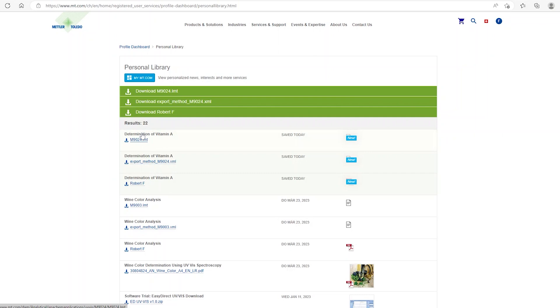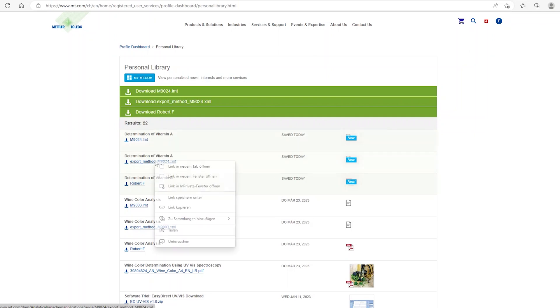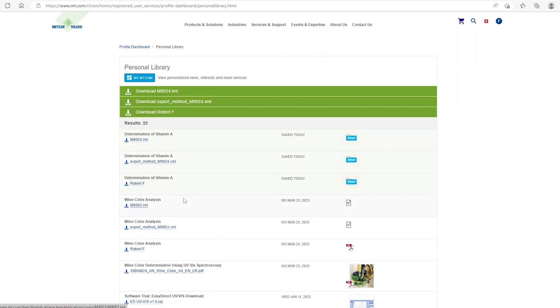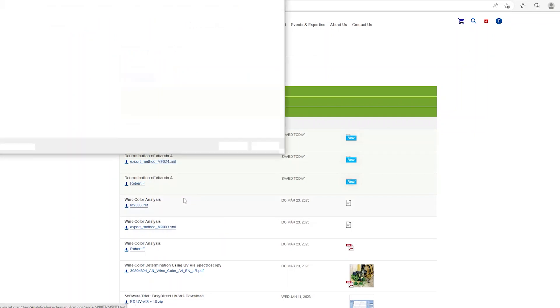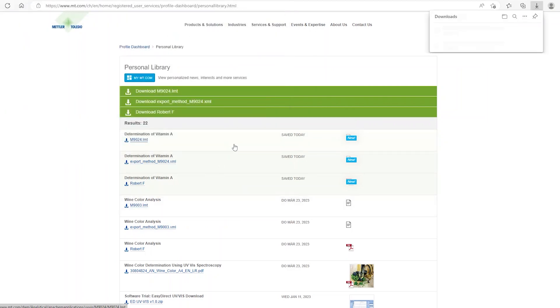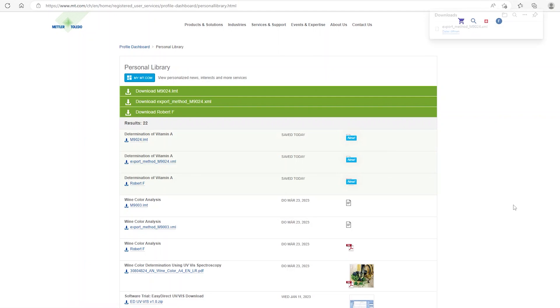We are now interested in the Standalone method, so we can download this file. Depending on your browser settings, you may need to right-click on the method and select Save Link, then select the directory for the download — for example, directly on the USB flash drive.